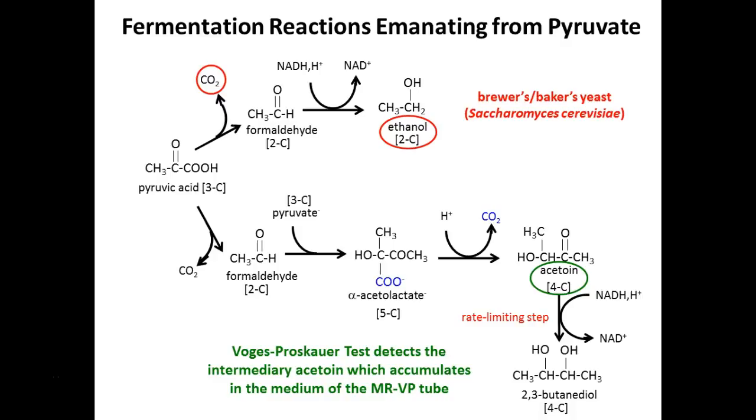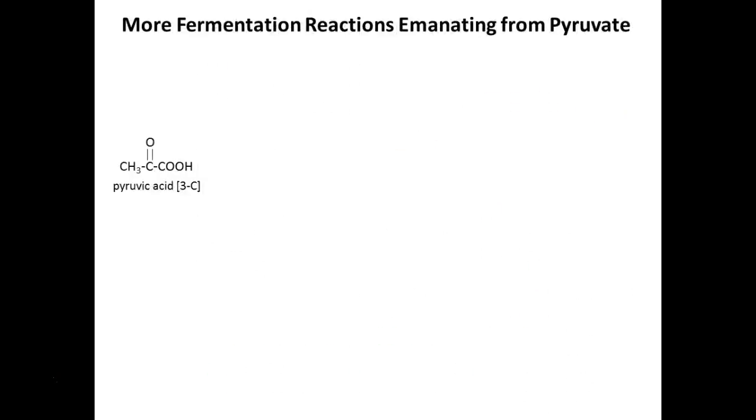So the acetoin accumulates in the media, and we were actually testing for the presence of that. We'll go through the chemical reaction of that later. That question, the present reactant is acetoin.